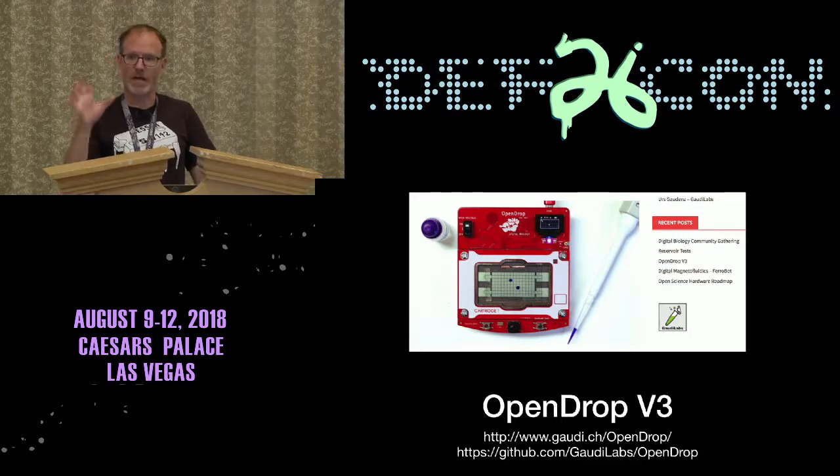By the way, this afternoon from 5 to 7, I'm leading a workshop on the badge, assembling it, putting it all together, showing how to create the hydrophobic surface that we need and all that kind of stuff. So let's just get right down to it and look at some videos.